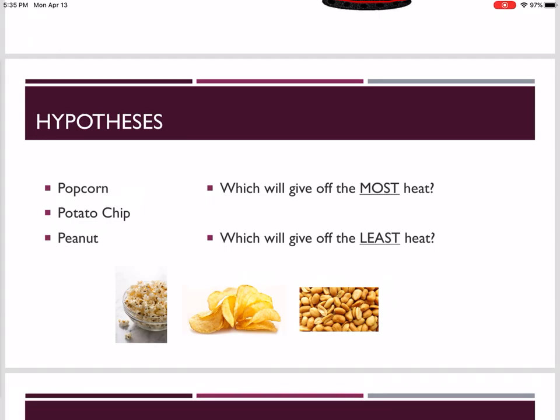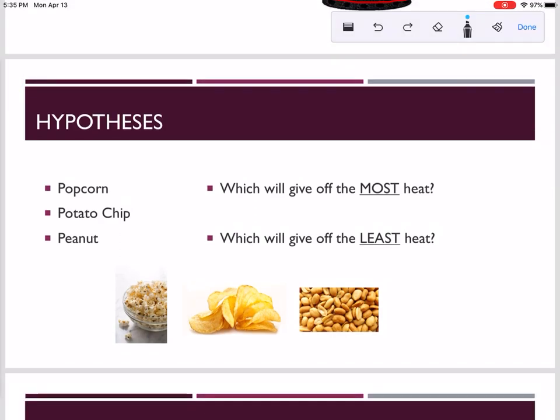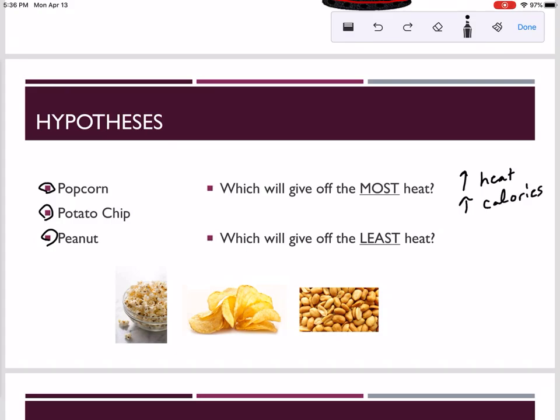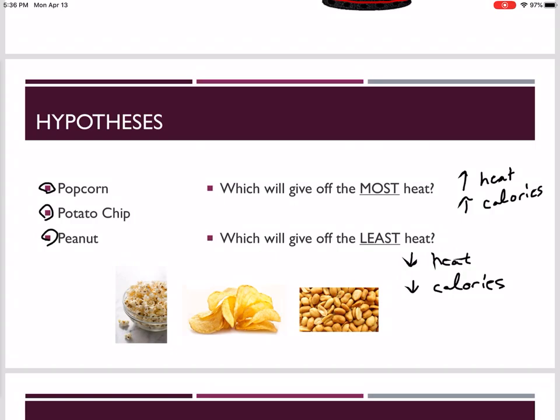Now that we've introduced both calorimeters, I'd like you to make some hypotheses. We're going to be measuring the heat content of three food samples: popcorn, potato chip, and peanut. Jot down which of these three foods you believe will give off the most heat and therefore contain the most calories, and which will give off the least heat and contain the fewest calories. Pause the video if you need to — we're going to see if you're right.